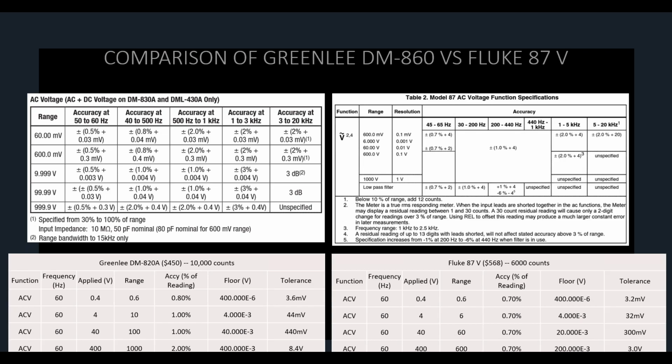I can tell you from a lot of experience, more of the units with the 3-point resolution have been purchased with the assumption that because of the third decimal point it is more accurate, but that's false. The third decimal is actually irrelevant. They did it as a marketing ploy to catch people seeing, oh, it's got 3 decimals, I'm going to buy that one.